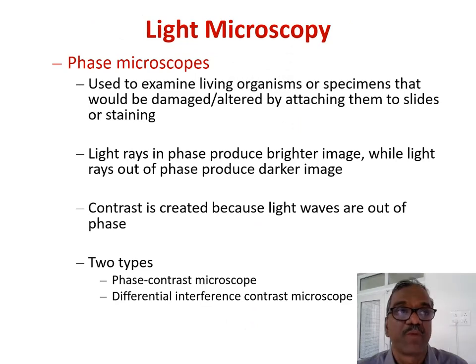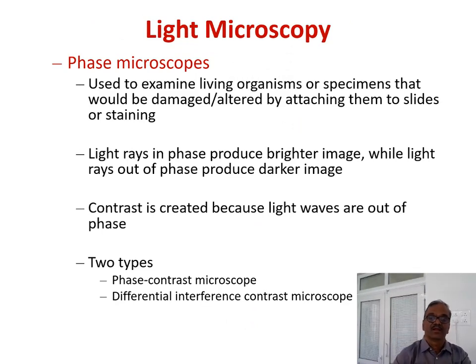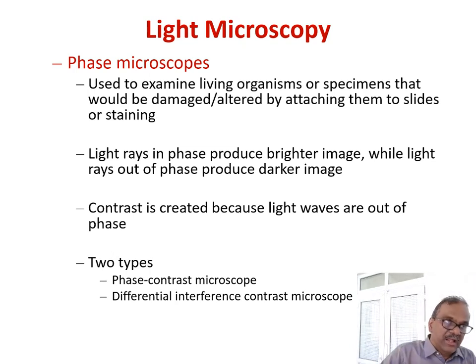Then phase contrast microscopy. Already we discussed, here the phase plate is used. The light rays in phase produce a brighter image, while light rays out of phase produce a darker image.